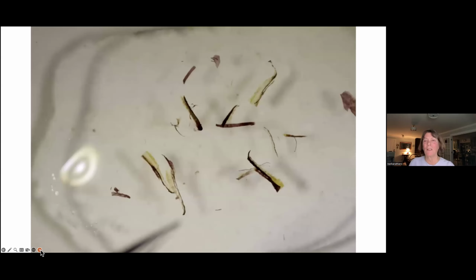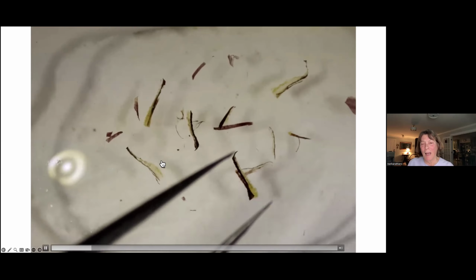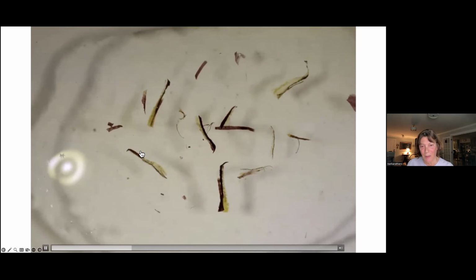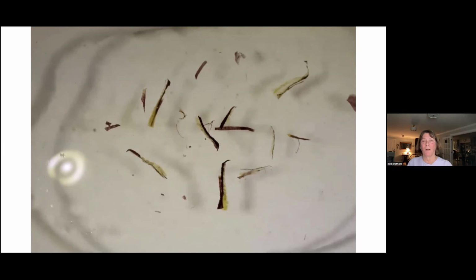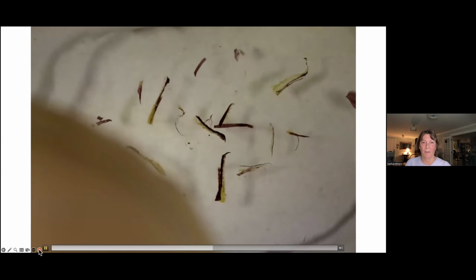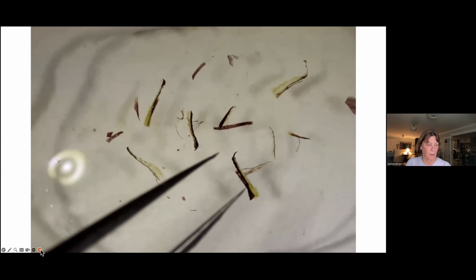But eventually I did get a bunch, some that could be used. And I spent a little time separating them out. It's not that critical, but I tried to get them all flat and also in the middle of the slide in a single drop of water. And if the water isn't enough, I can always add a little bit from the side. But again, I don't want my best section to go floating off the slide or out from underneath the cover slip.